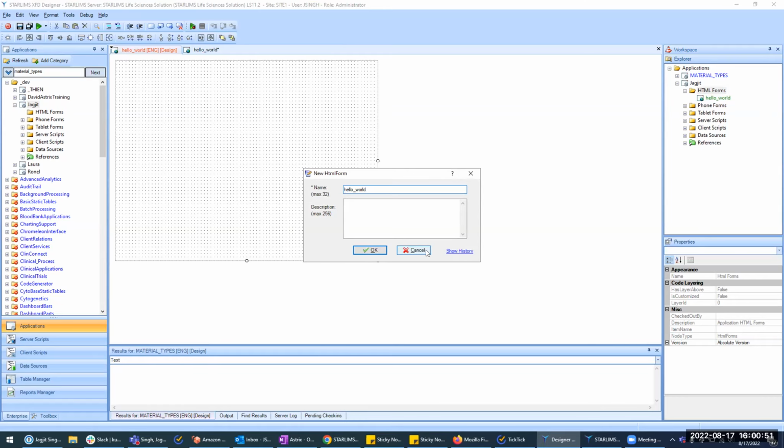This is typical, right? This hello world, for those programmers.